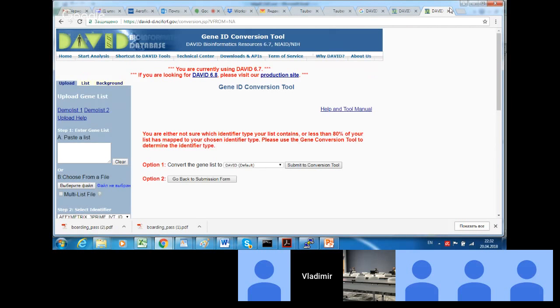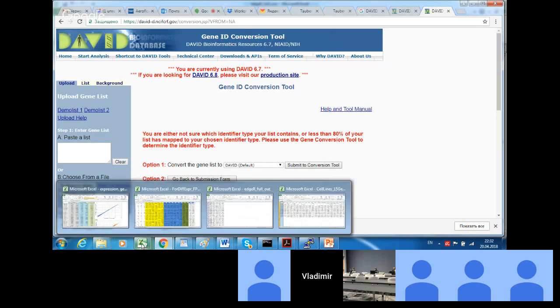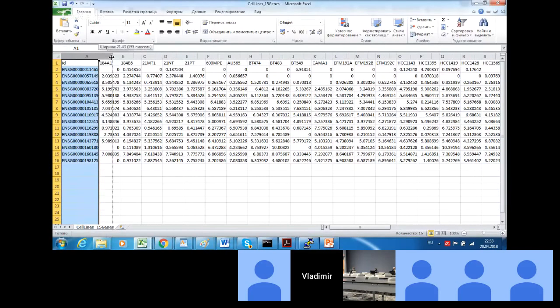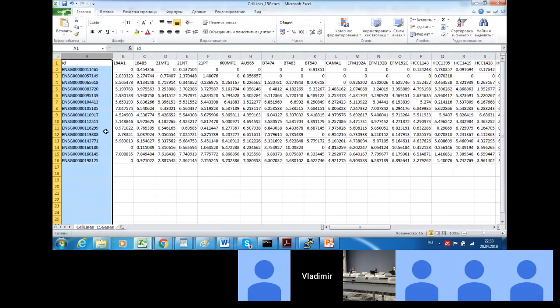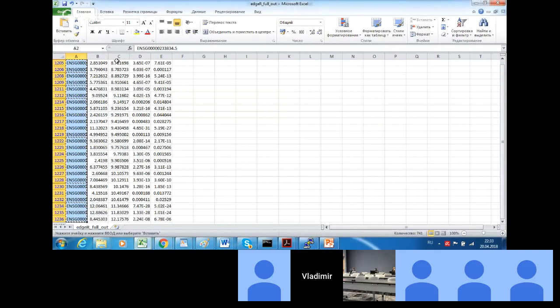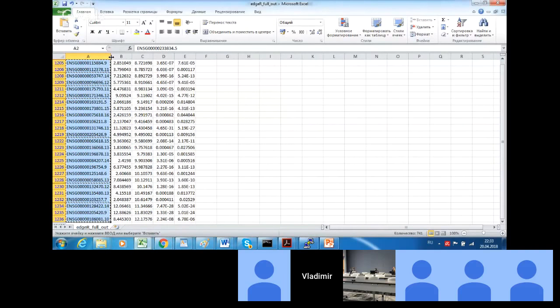So in our case, DAVID says that it cannot process all our identifiers. Just a moment, let me open it. What's the reason? The reason is the structure of the names.